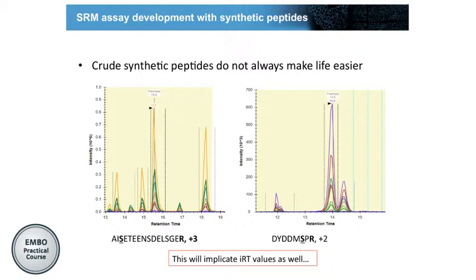This, in this case, is not a proline, and we see that whenever you have a proline. And what is very useful when you order these synthetic peptides, some of these companies will tell you to be aware of certain things, because you have a lot of N's or E's that can form problems, or you have prolines, etc. Read the warnings. They're useful.